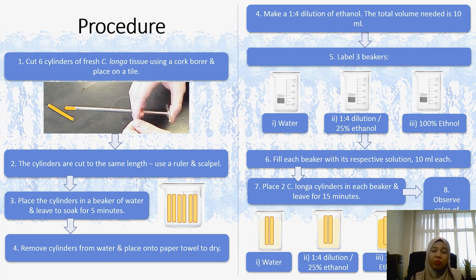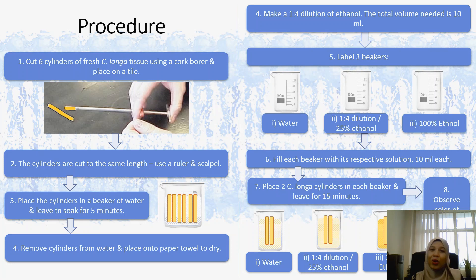Fill each beaker with its respective solution, 10 ml each. Then place 2 kukumalonga cylinders in each beaker and leave them for about 15 minutes. After 15 minutes, observe the colour changes of the solution in every 3 beakers as your results.